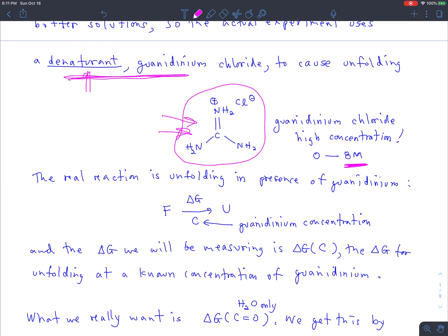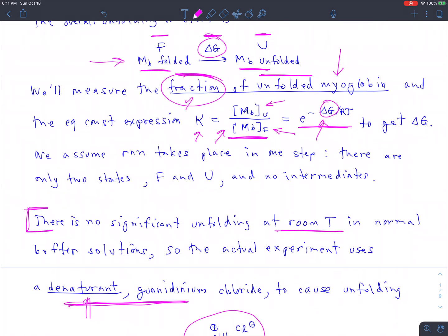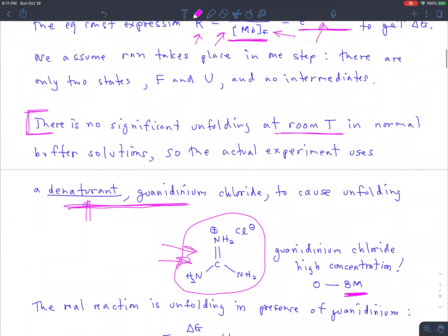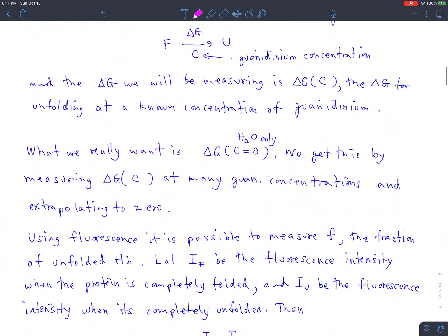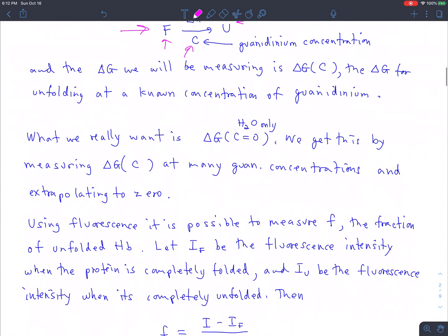If you're at low concentration, it doesn't unfold the protein, or it mostly doesn't unfold the protein. And as you raise the concentration, more and more of the protein unfolds. We can measure the fraction that's unfolded at every concentration, and therefore we can get the free energy as a function of concentration, and that's what we're after. So here is our reaction again. F goes to U, as a function of guanidinium concentration.